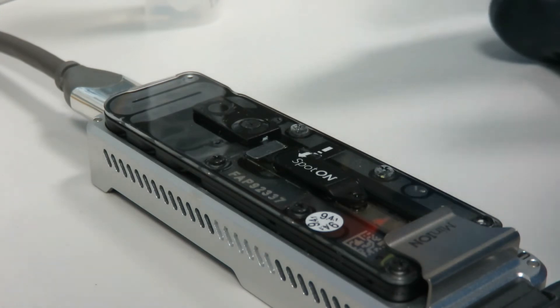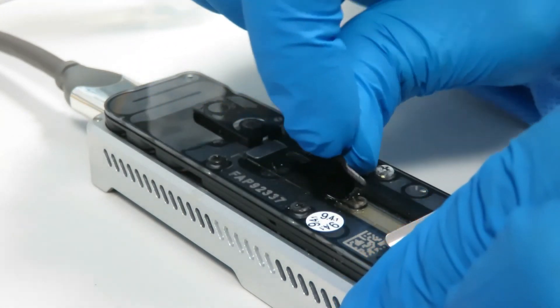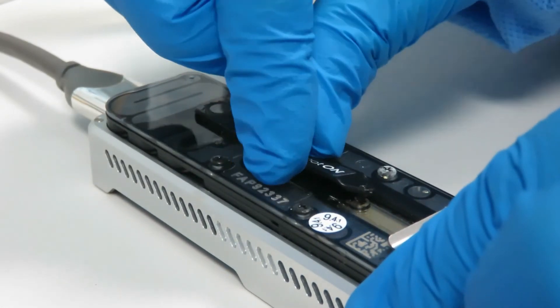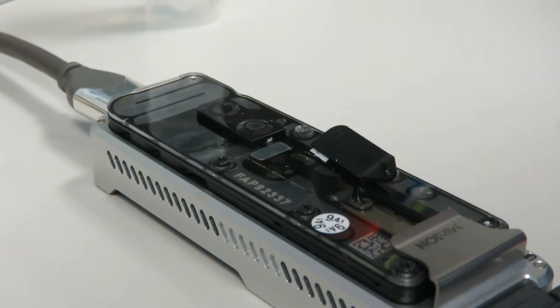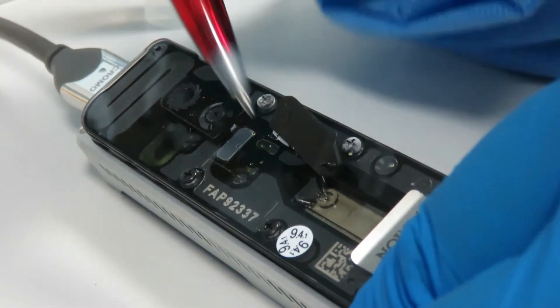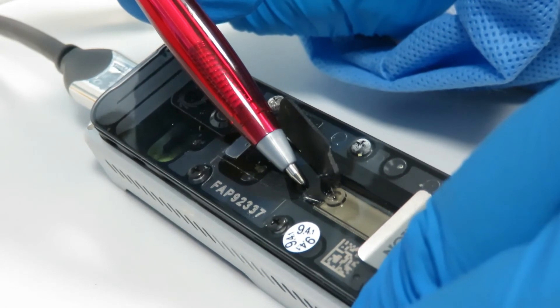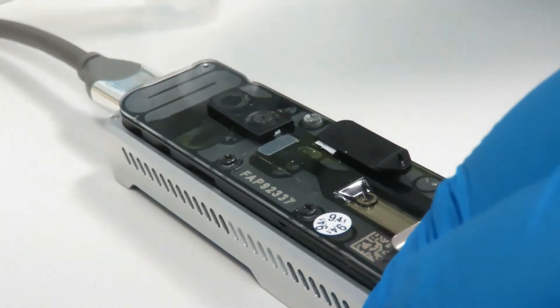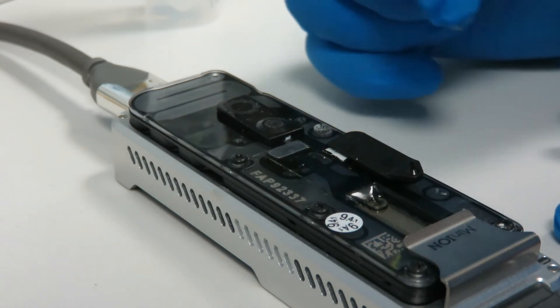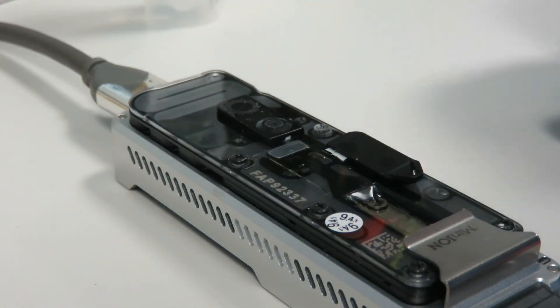That's the first step — you add your 800 microlitres. The next step is to open the spot-on port: you just pull up and over. It's attached by a little piece of sticky paper and it flips up like that. There's a little hole there — that's the spot-on hole — and that's where you will eventually add your sample. For the next part of adding buffer you have to have that hole open, to make sure there's no storage buffer trapped anywhere within the ASIC panels.